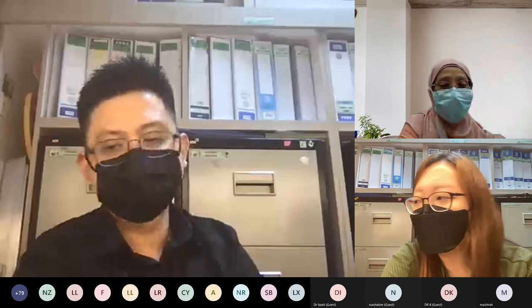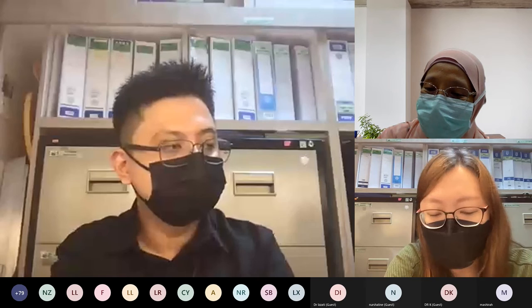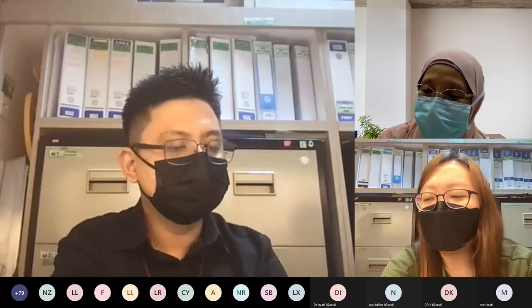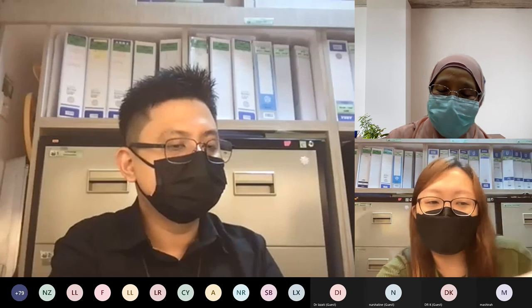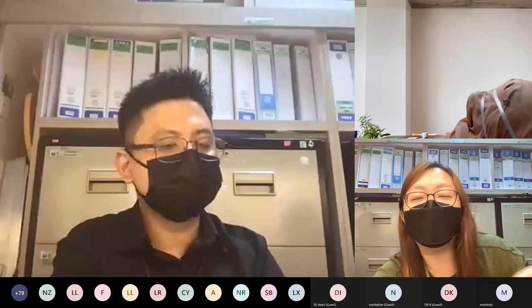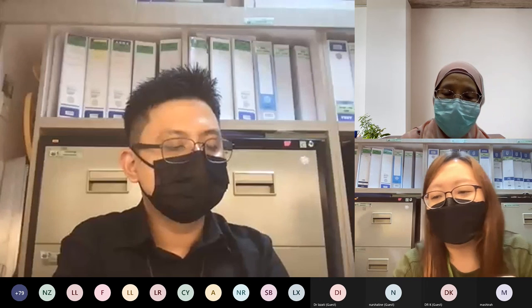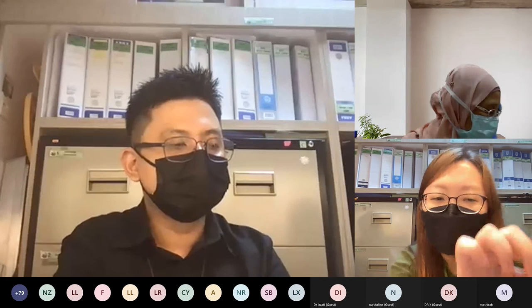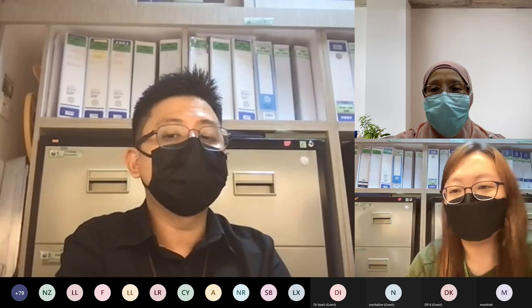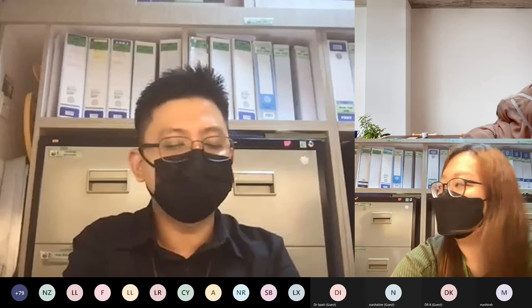Oh yeah, because I am thinking if by hand, for example in Sabah, they want to send from OS to here, we'll advise they put the specimen in the biohazard bag, right? And then in a rigid container, for example an ice box or a big plastic container. You don't really hold the bag to us lah. Then send it properly in that way. Then it will be better. Oh yeah, and get it covered.